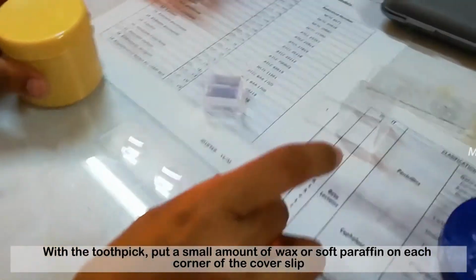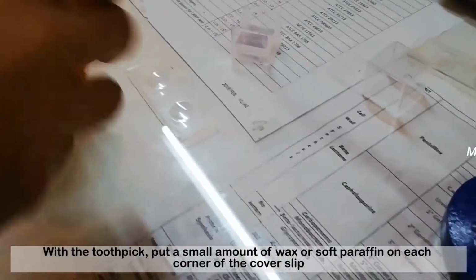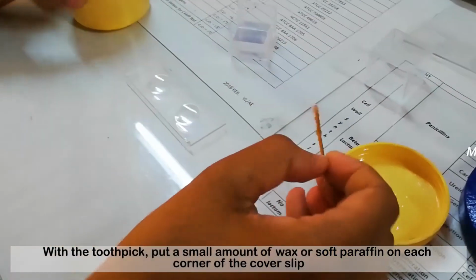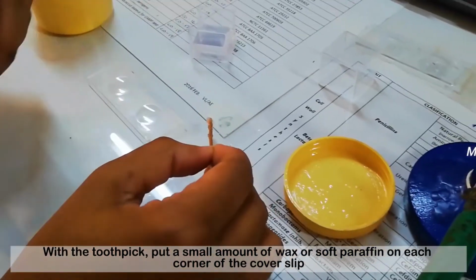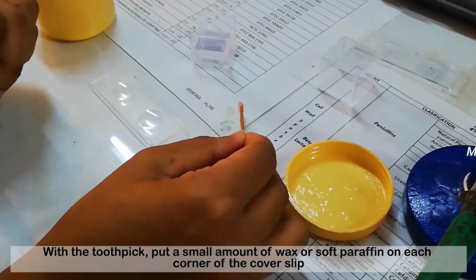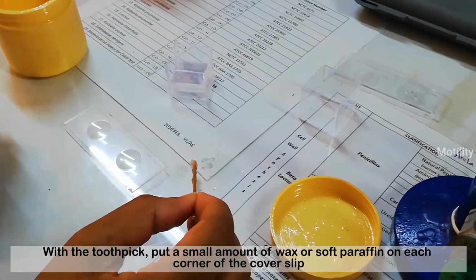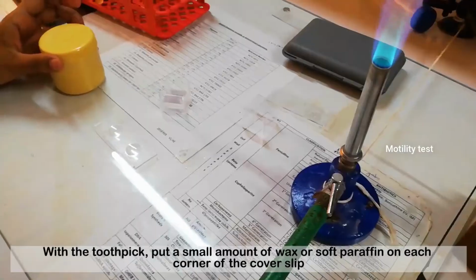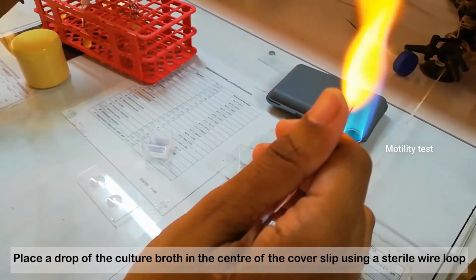Hanging drop method. With the toothpick, put a small amount of wax or soft paraffin on each corner of the cover slip. Place a drop of the culture broth in the center of the cover slip using a sterile wire loop.